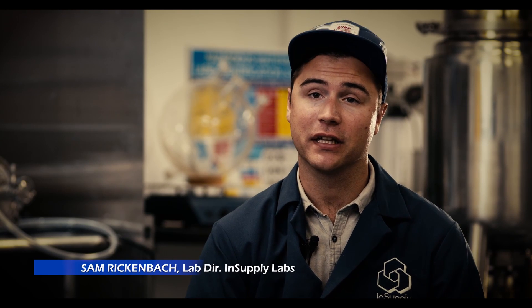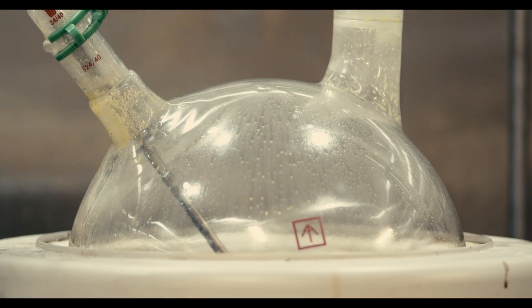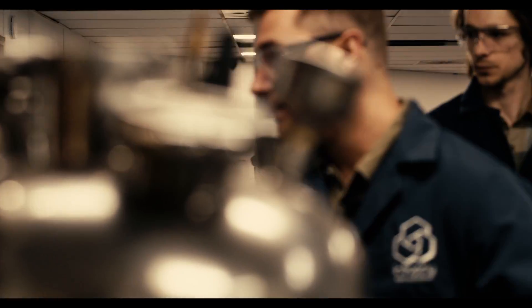Traditional short path distillation units are typically made completely of glass. You have a lot of potential for an implosion because of the thin walls and from them not being filmed properly. They hurt people and they lose product. So it helps to have that increased durability.